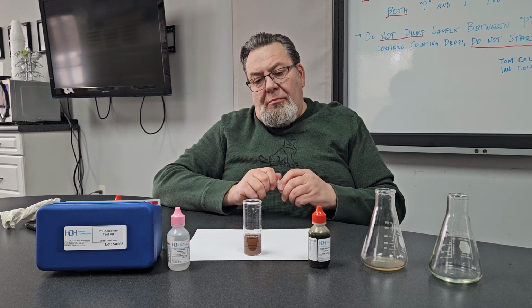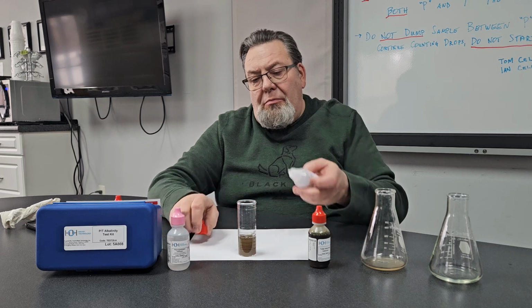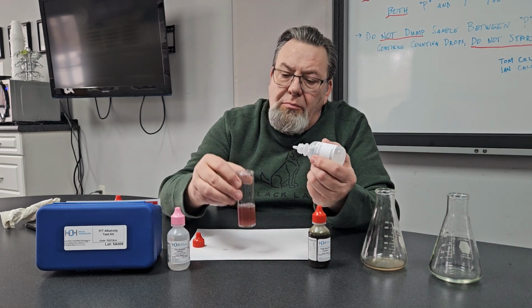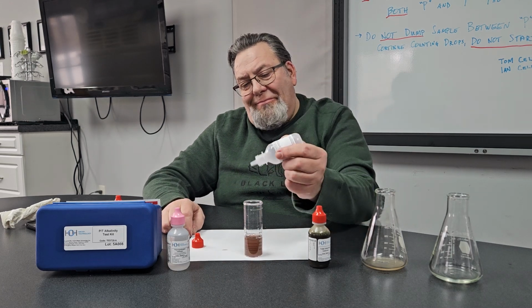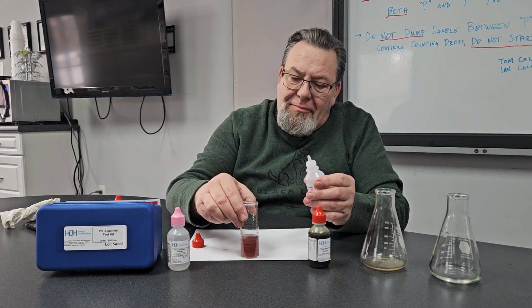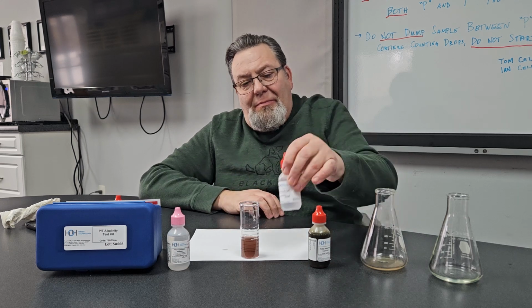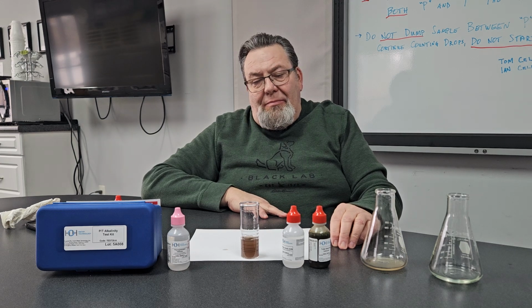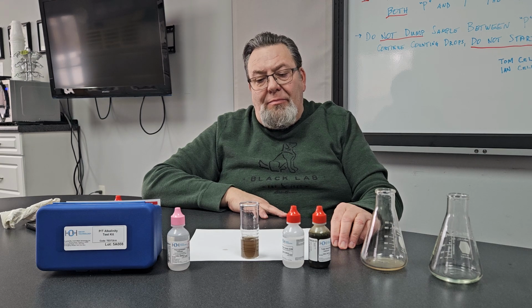Sometimes the sample may revert back to a slightly green color. In this case, we're going to add 1 more drop. Maybe 2. Our total here now to reach this was 7 plus an additional 7 drops for a total of 14. 14 times 50 is 700 parts per million as T alkalinity. You'll enter this into the cloud reports. The OH alkalinity calculation will be already done for you.